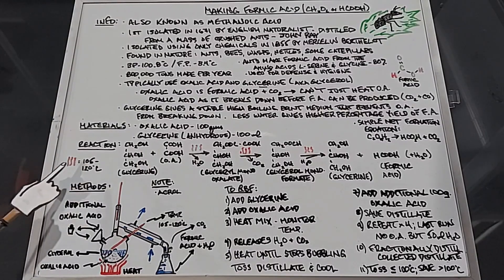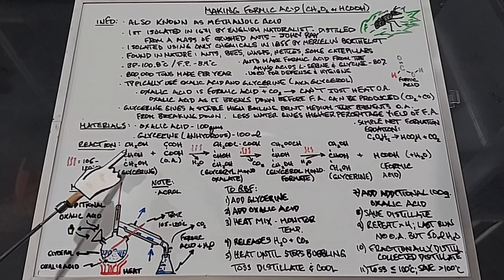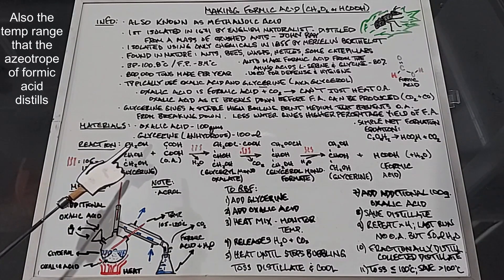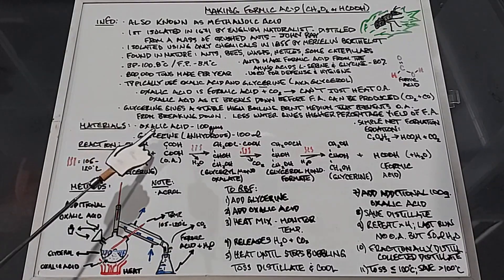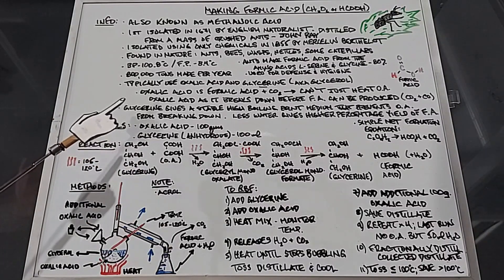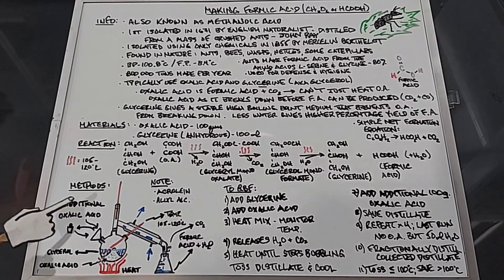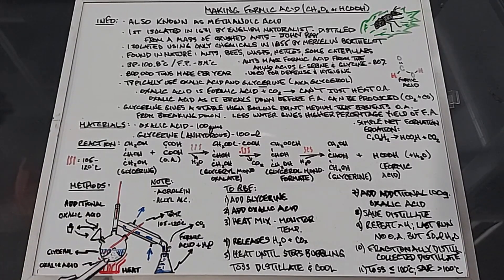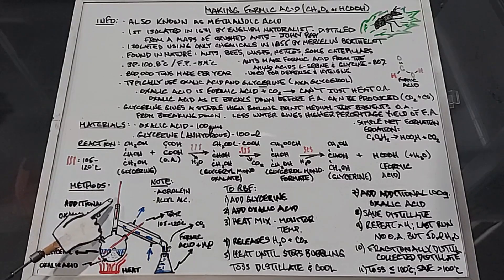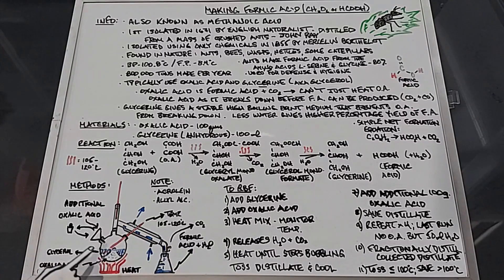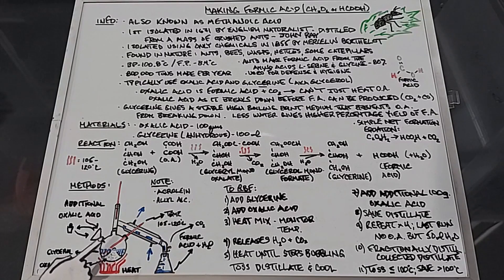When heating this, the temperature should be between 105 and 120 degrees Celsius — that's the range where you start getting higher percentages of formic acid distilled over. If you used completely anhydrous oxalic acid and anhydrous glycerin, you wouldn't get formic acid production until around 130 to 140 degrees Celsius, but by using a little water you bring the boiling point down, making the experiment safer. For our setup, we'll use a 500 milliliter round-bottom flask with a triple neck: the top for the distillation head and thermometer, and a second thermometer going down into the glycerol/oxalic acid mix to monitor the temperature between 105 and 120 degrees inside the mix.